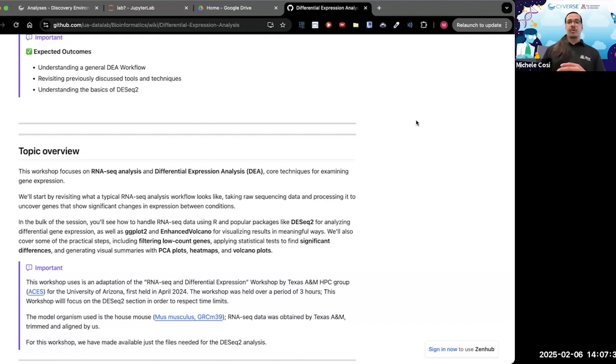So for today, right after running DESeq2, we're going to be using ggplot2 and EnhancedVolcano, as we are going to create histograms and a volcano plot that you may want to learn how to read, or that I learned how to read whilst creating the materials. So I may stumble on myself, but please let me know if something does not work for you.